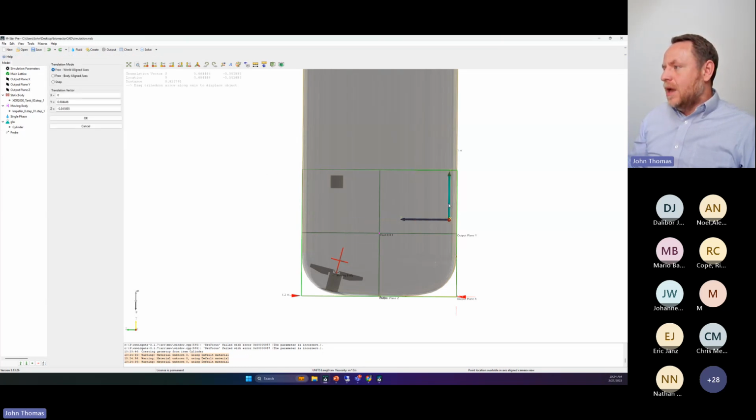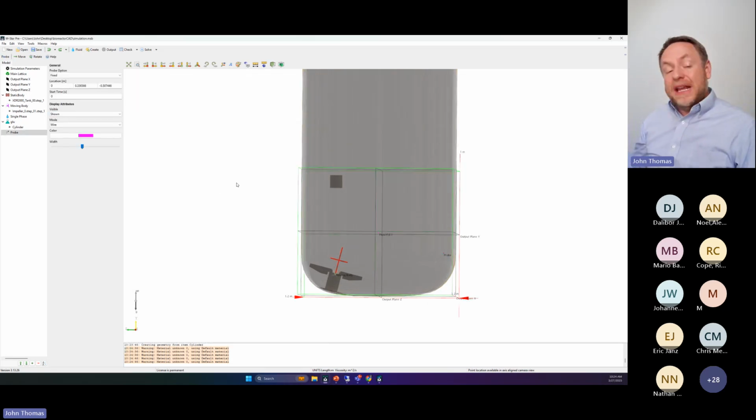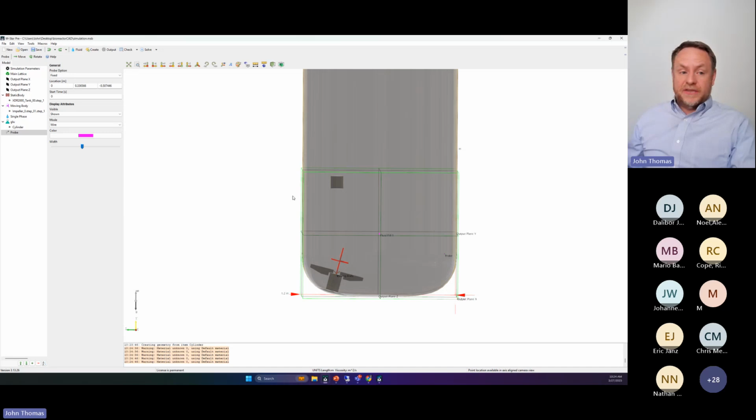I'll put the probe over here, which is where a probe typically is next to the vessel wall. But I'll go ahead and plop that there. But in addition to this, the code will naturally tell me what it thinks the distribution of this glucose is across the vessel and how it's converging towards a fully homogenized state. So let's watch this here.